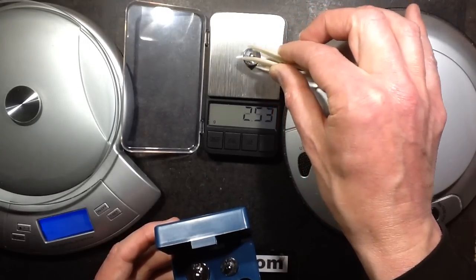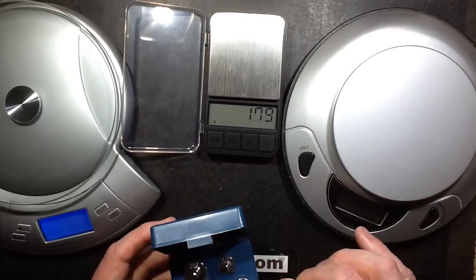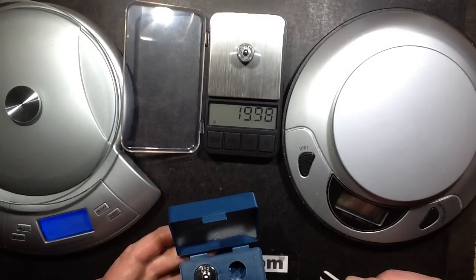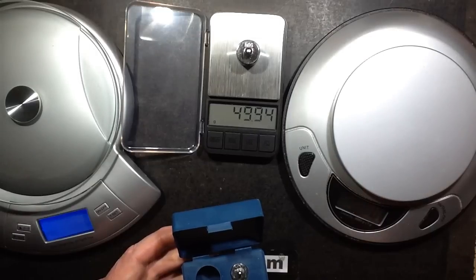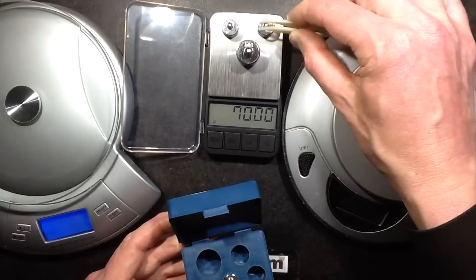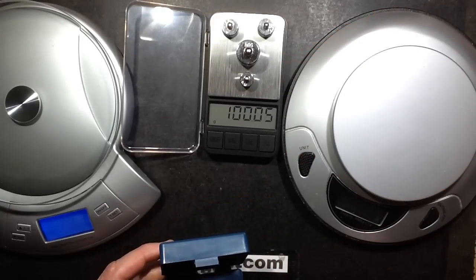What's this one — is this a 20 gram? 19.98. Another 20 gram weight — 19.98. And the 50 gram weight I believe — 49.99, that's very good. So what if we stick them all on — not all of them, but make it up to the equivalent of about a hundred grams. A hundred point zero four — that's very good.